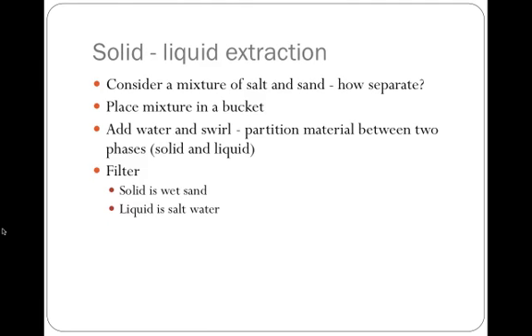The first technique we'll look at is solid-liquid extraction, where the two phases are a solid phase and a liquid phase. Let's just consider a hypothetical. Suppose you had a mixture of salt and sand. How would you get the salt away from the sand? Well, one way would be to get a magnifying glass and tweezers and look at each particular grain and make two piles. That's not terribly efficient.